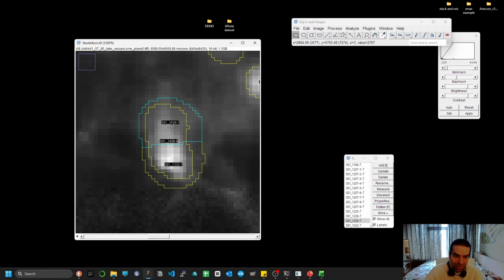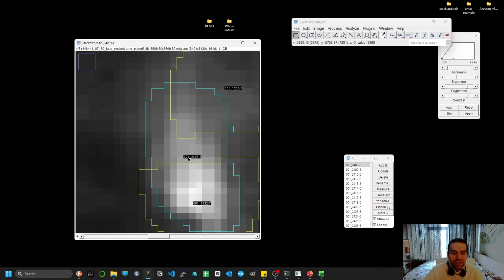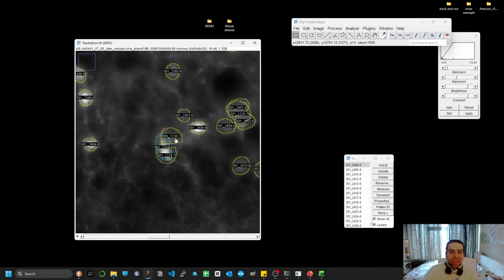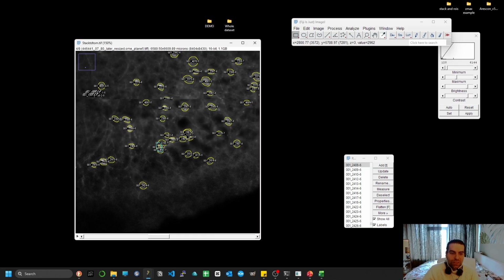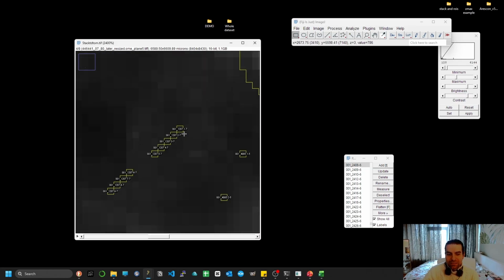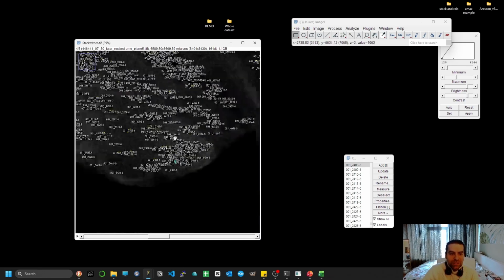Which one is it? I think it's the 7. Let's see. Yeah. As you can see, this is the mere outcome of echoing signal from two different cells, and by changing the defaults, that should be taken out. And if you see some small regions of interest like here, this is because I haven't used filters for area in the XY filtering, but you will do it and you will have no problems like this.